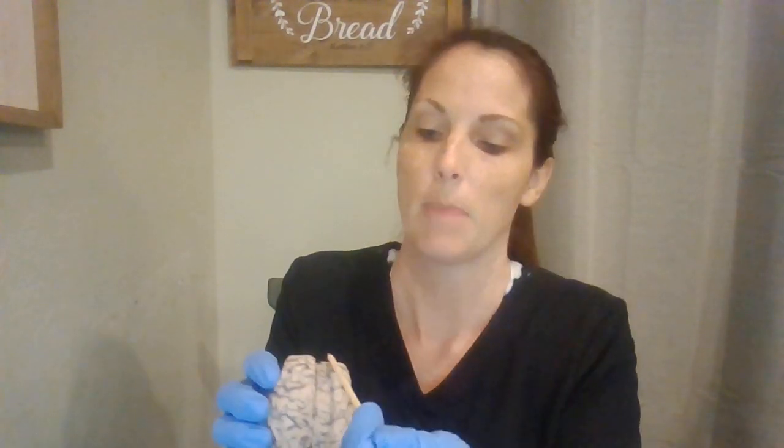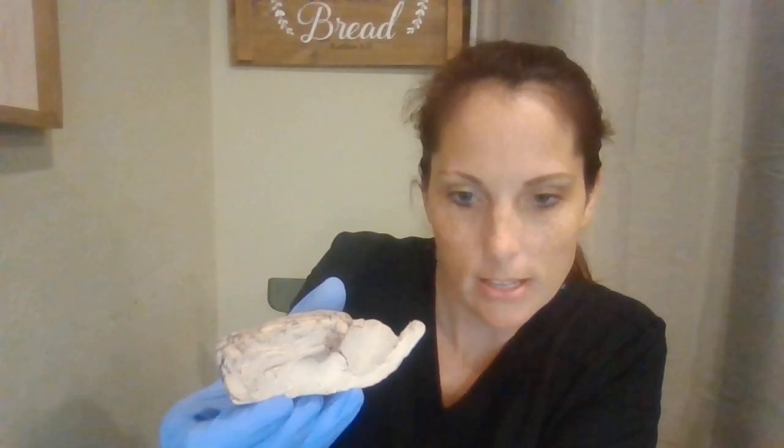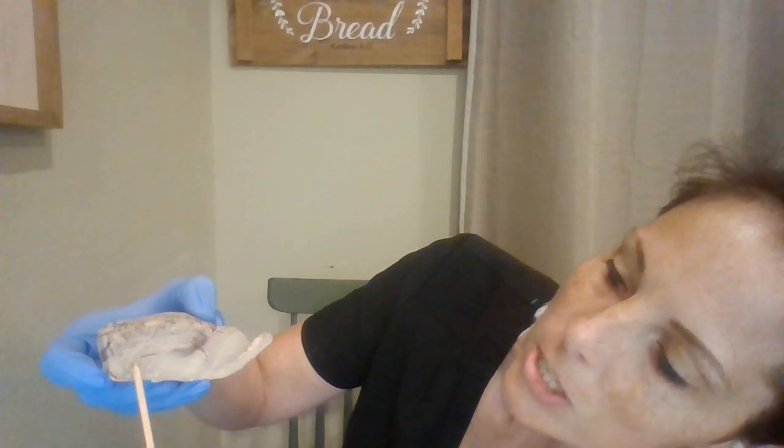So if we take this back around where we can see the whole brain, like I said, I've made a mid-sagittal cut already, so I'm going to take it apart. There's one side that's better than the other. I have to remember which one it was. So in this here, you have the upside down Nike check, which is going to be the corpus callosum. And then underneath that, you have the lateral ventricle.